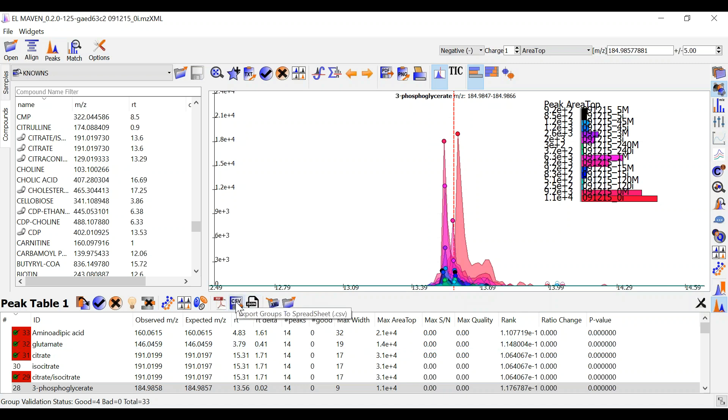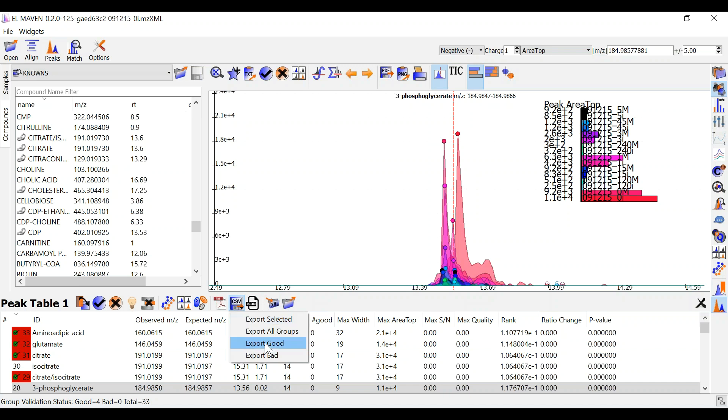I will create a csv for this demo. I can either export all the selected groups, all the good groups, all the bad groups, or every metabolite group that has been detected in peak table 1.